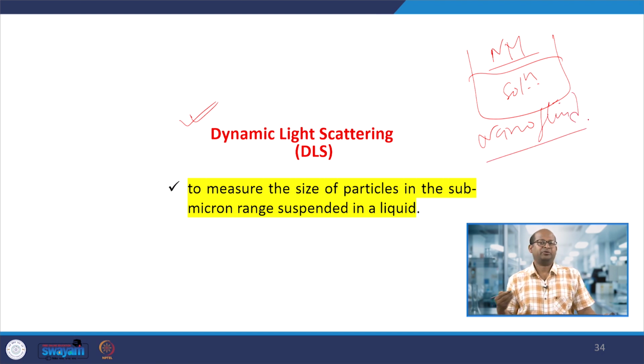So there is a base fluid, the nanomaterial is present with it, and sometimes, to make it more stable, the nanomaterials are stabilized in the base fluid by using some surfactants. The nanomaterials may be very small in size, but sometimes agglomeration also occurs. Larger particles form, and as a result stability goes down after 25 or 30 days. So that is very important.